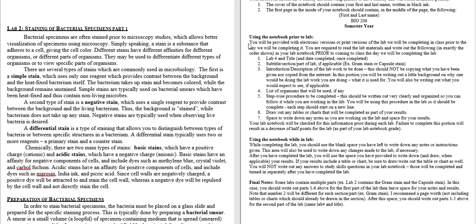Using the notebook prior to lab, I'm reading over here. You'll be provided with electronic versions or print versions. So I have the electronic versions posted on Canvas. Prior to class, you'll be using that, and you will need to read the lab materials and then write out the following. So this is in the exact order shown. And it's important that each week you do this correctly because you will be signed off on your lab notebook.